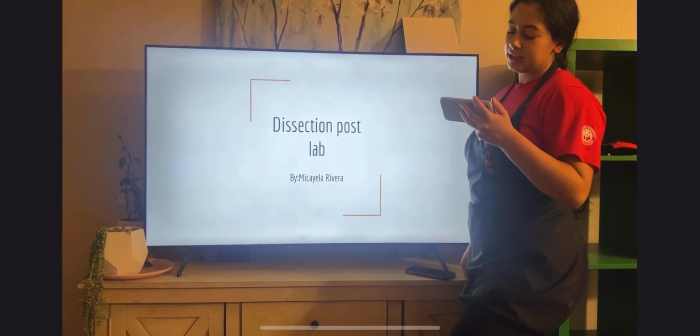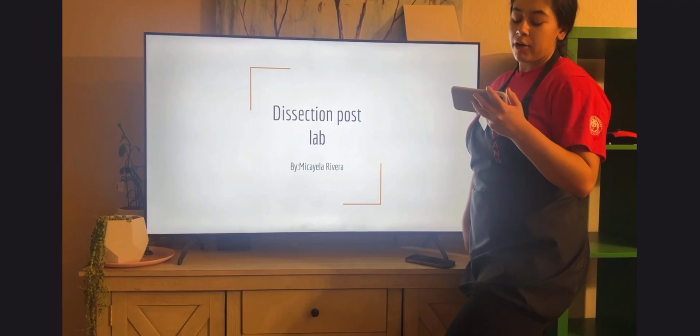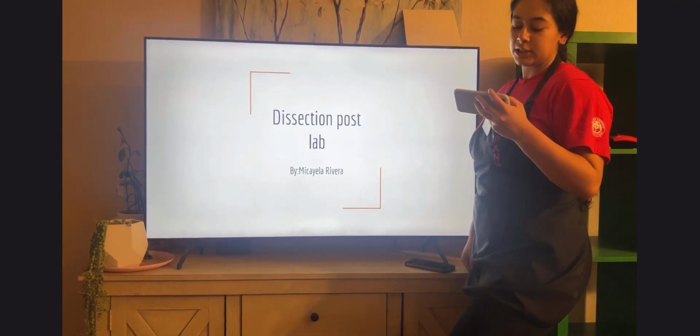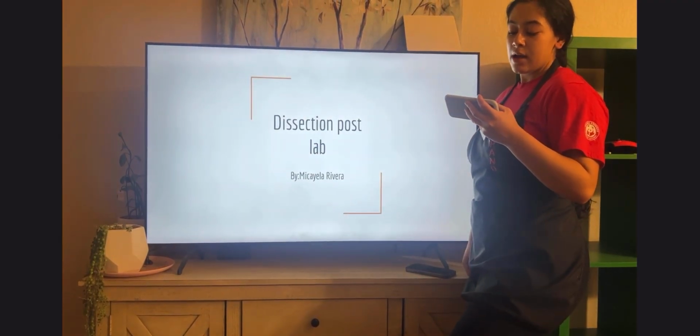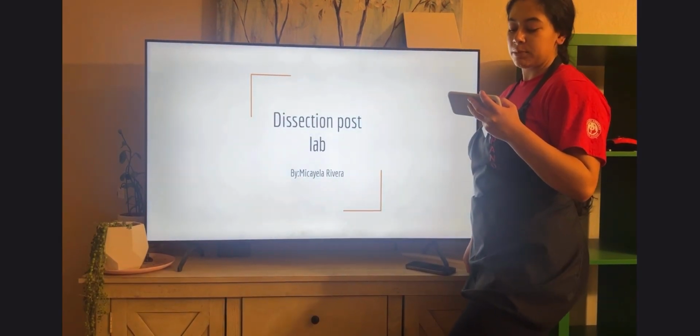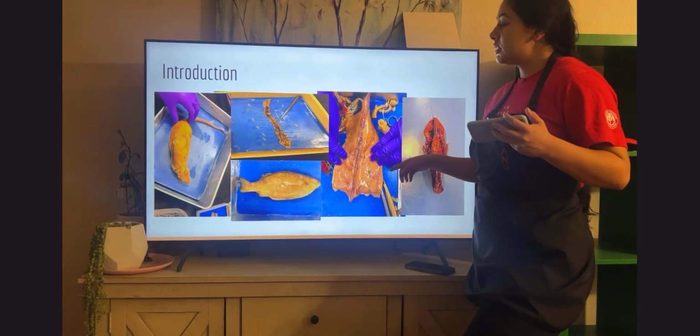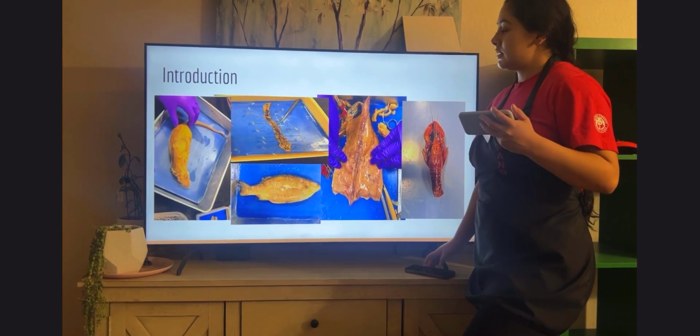In this video, I'll be discussing the anatomy of the rat based on the dissection we did in class. I will be comparing the rat's respiratory, digestive, and reproductive systems to the other animals we've studied, including the earthworm, crayfish, perch, and squid.